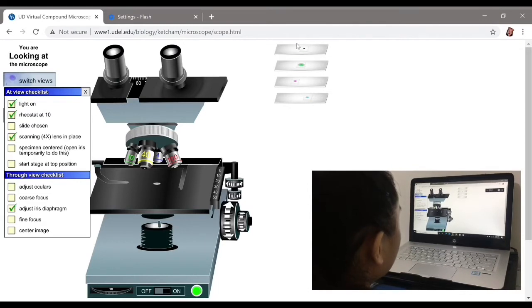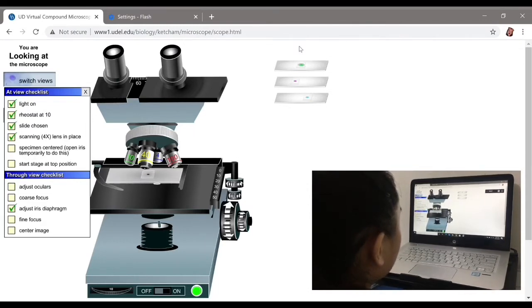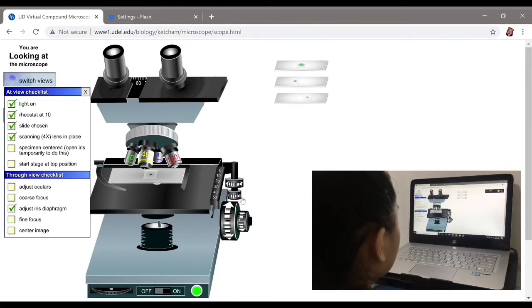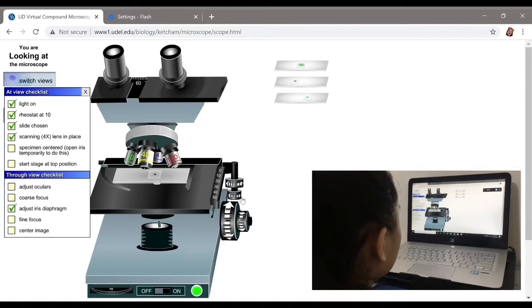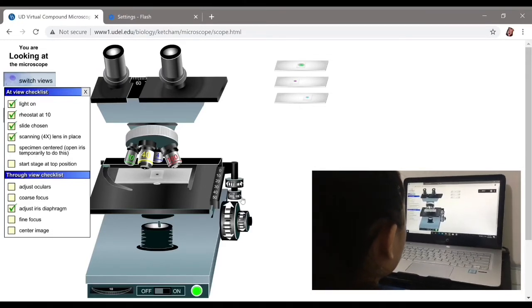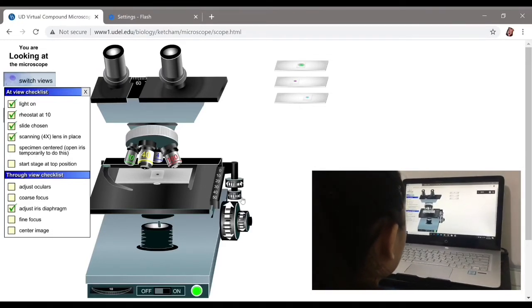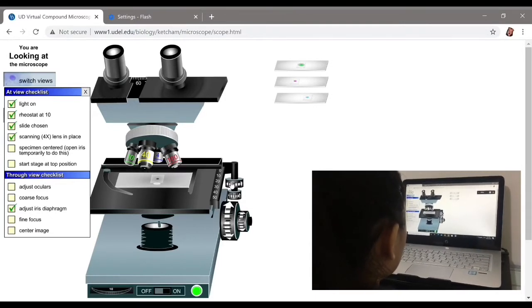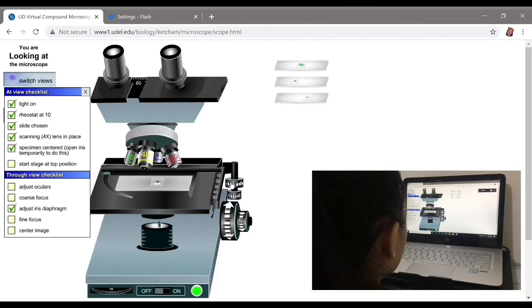In the simulation, I clicked on the slide letter E to become my desired specimen. The scope is already in low power. That is why I proceeded in centering the specimen to the circle of light through clicking the X and Y knobs together with the coarse adjustment knob.